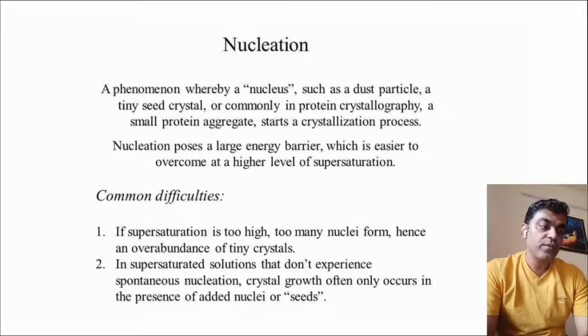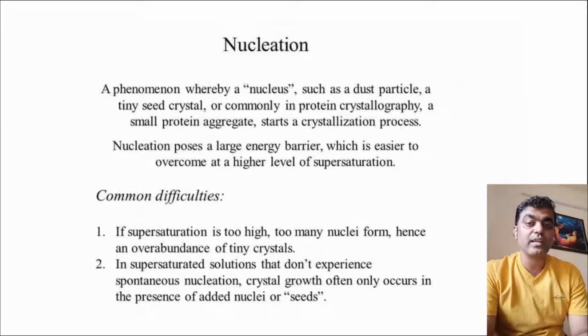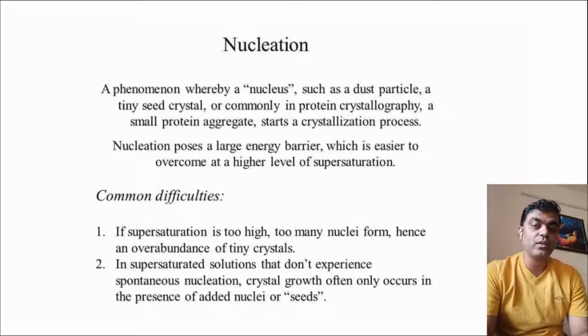Okay, if a supersaturated solution does not experience spontaneous nucleation, it does not experience crystal growth, and growth only occurs in the presence of added nuclei or seeds, then also it is a problem. Because if it is not a spontaneous nucleation, what will happen? The uniform growth, in all the 360 degrees, of the crystal will not take place.